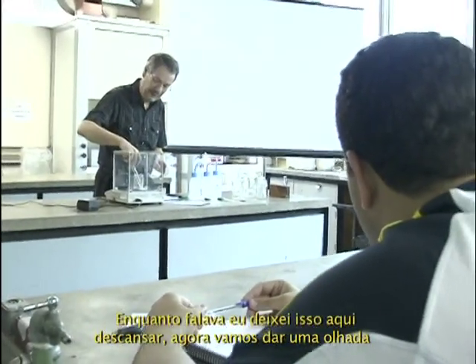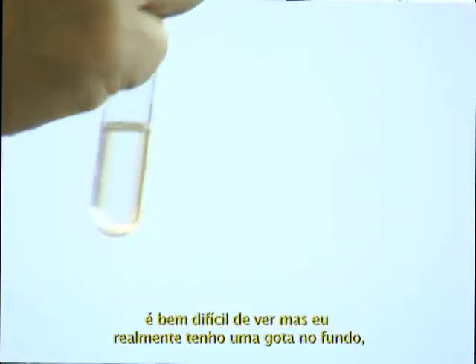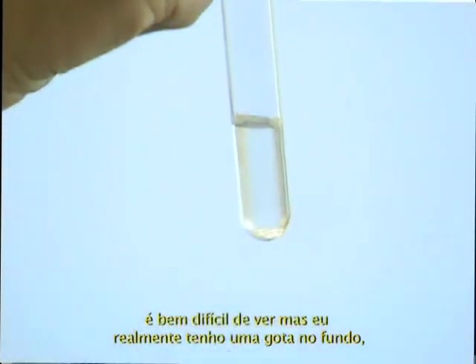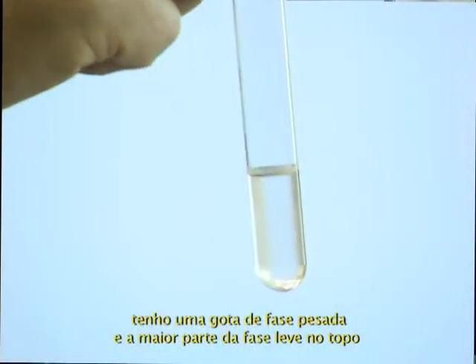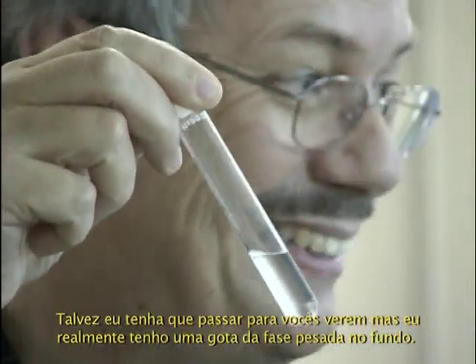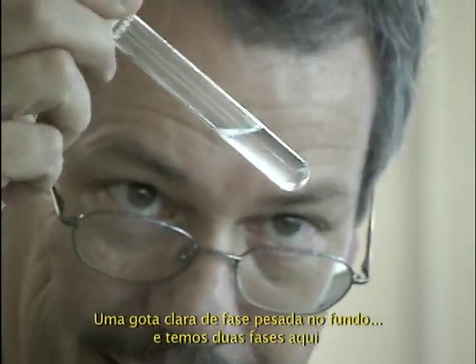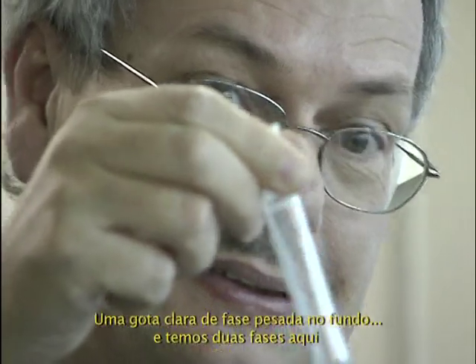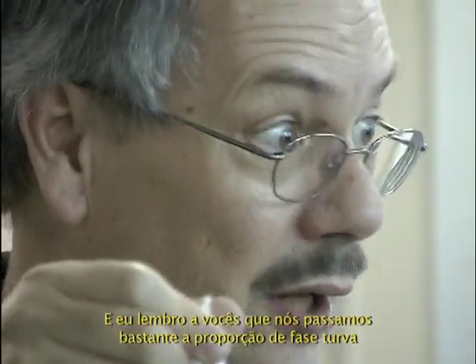Let's have a look now. It's very difficult to see, but I do have a drop at the bottom. I have a drop of heavy phase, and most of the light phase is on the top of it. So you don't see it. I may have to pass the tube to see it. But there is a drop of heavy phase, a clear drop of heavy phase at the bottom. So we do have two phases in this one. And I remind you that I pass the cloudy proportion a lot.